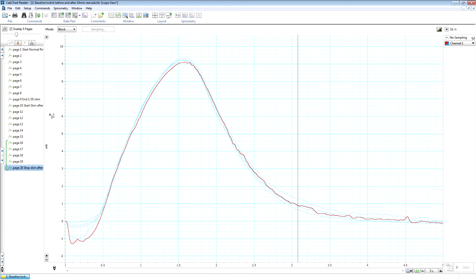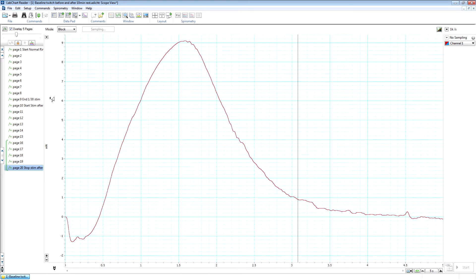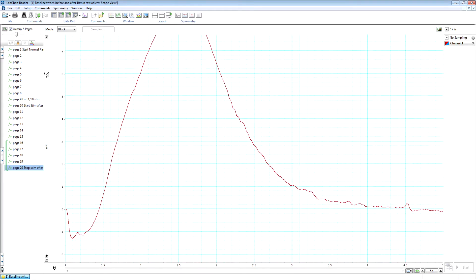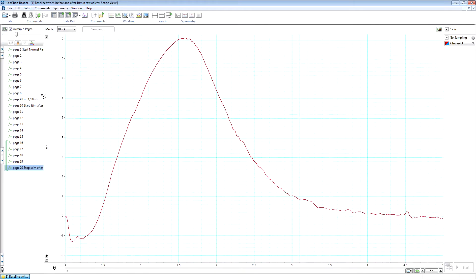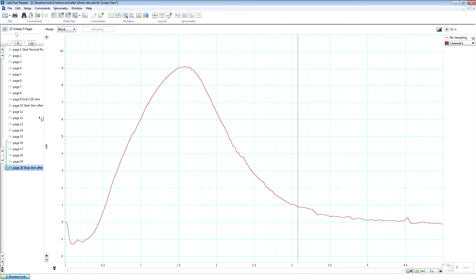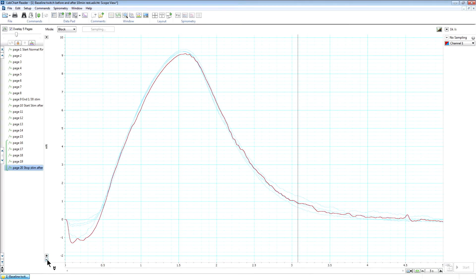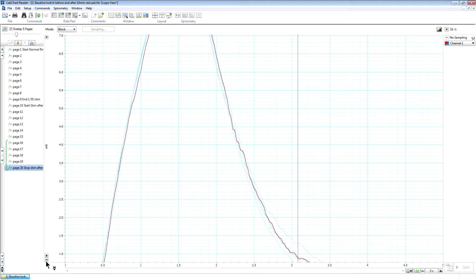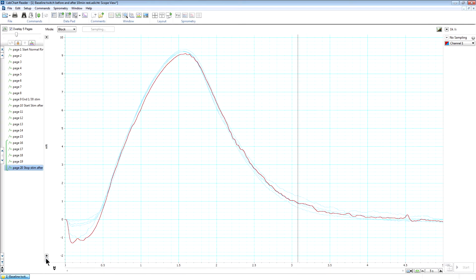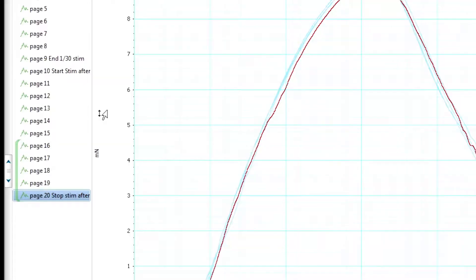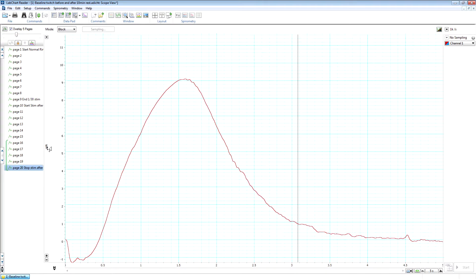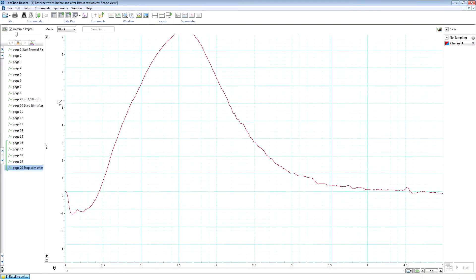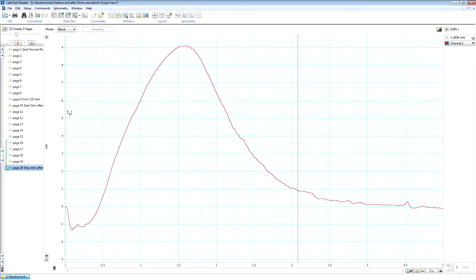And that's useful because you can change the level of zoom in smaller increments than you can if you were to press the plus and the minus buttons down below. When the cursor changes to a double headed arrow, you can then slide the whole trace up and down.